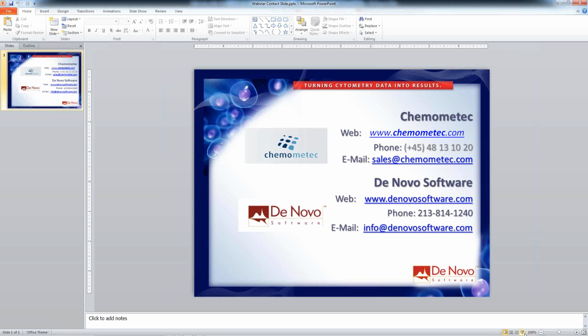Great, and it looks like there was another question or comment here regarding quadrants and the limits set for the quadrants. It's not totally clear what the question is, but I just want to let you know that in FCS Express you can change these quadrants however you want if you set up quadrants. I know that the quadrants in the FlexiCyte software are also flexible as well, as you saw Henrik moving those around. In FCS Express you can move quadrants, you can move gates any way that you'd like. All that is freeform and open to you as the user.